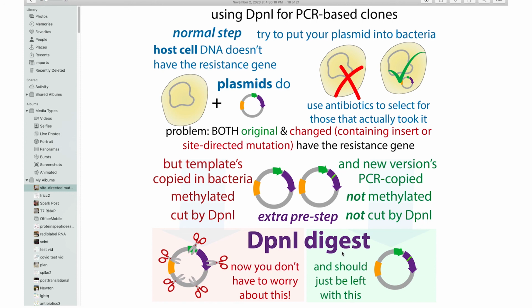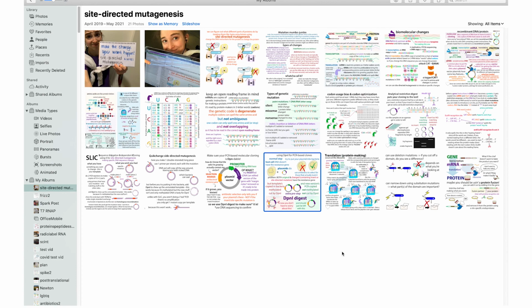That can be a problem if you're trying to ligate, because you need that phosphate group for ligation. So you need to add it beforehand with a kinase, like T4 polynucleotide kinase. Or you can buy it phosphorylated, but then you have to pay more. Anyway, hope that helps.